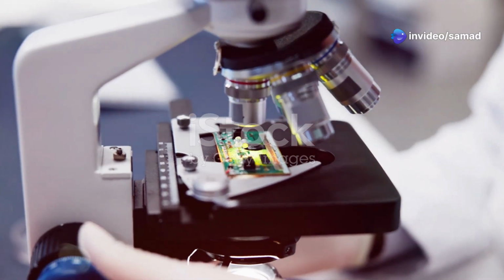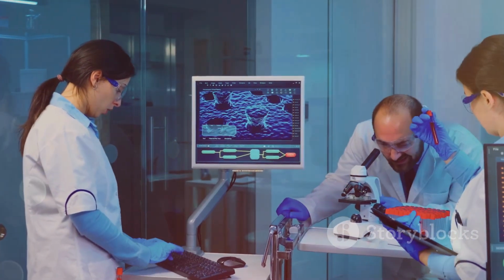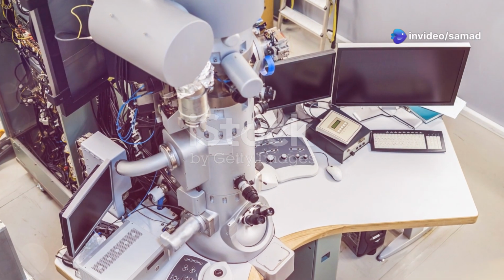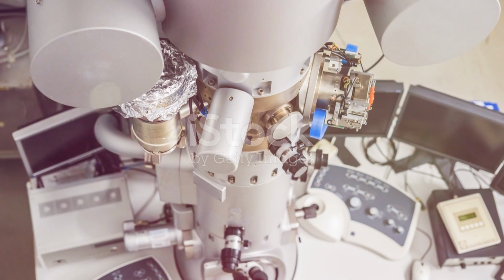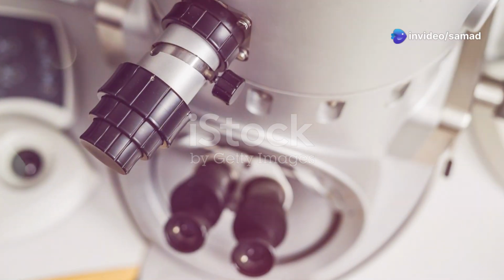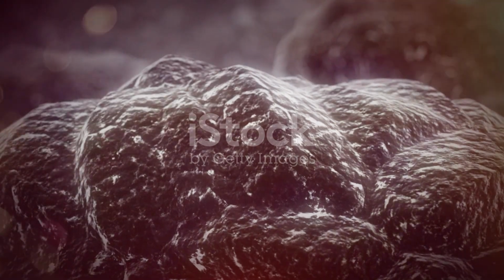As the electron beam interacts with the specimen, several phenomena occur. Some electrons pass straight through, while others are scattered or absorbed, depending on the density and composition of the material. These interactions are captured by detectors, which convert the electron signals into images or spectra. Two main types of electron microscopes exist: transmission electron microscopes, or TEMs, and scanning electron microscopes, or SEMs. TEMs, like powerful X-ray machines, transmit the electron beam through an ultra-thin section of the specimen, creating highly magnified images of its internal structure. SEMs, on the other hand, scan the electron beam across the surface of the specimen, producing detailed three-dimensional images of its topography.